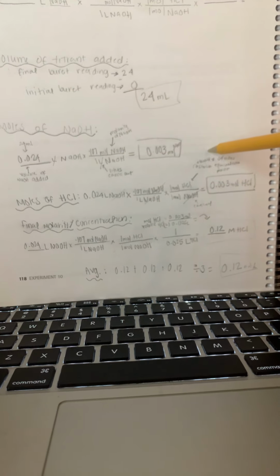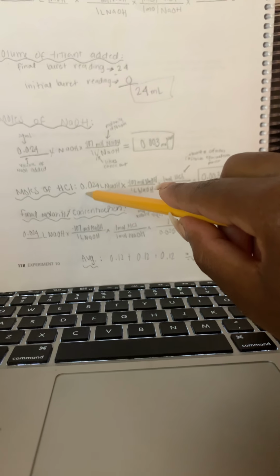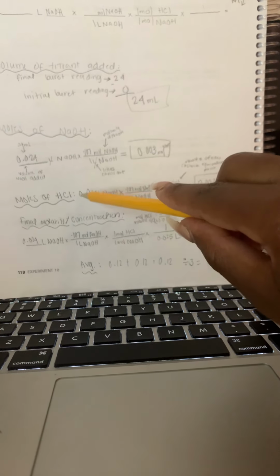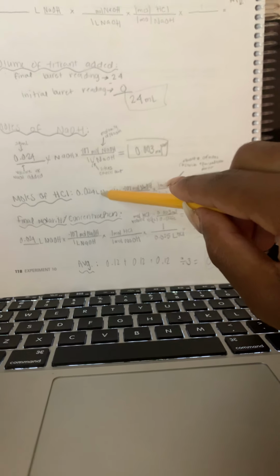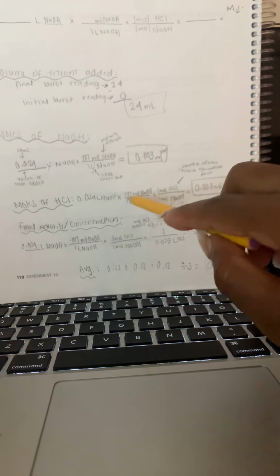Now, to calculate the moles of hydrochloric acid, we take 0.024 liters, which was the 24 milliliters converted to liters. So it gives us 0.024 liters of sodium hydroxide. And I just set up the equation right here, and it's 0.107 moles of sodium hydroxide divided by the 1 liter.